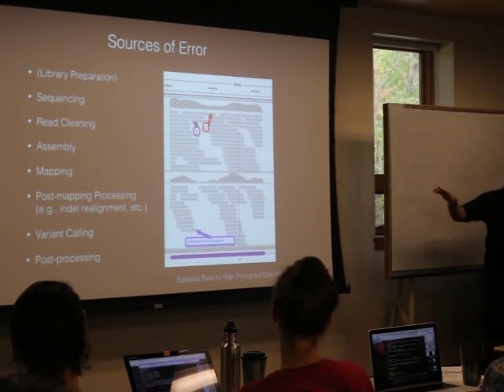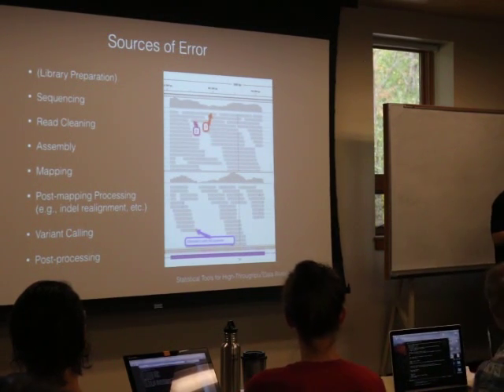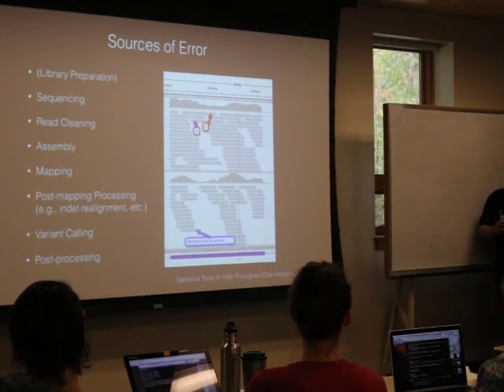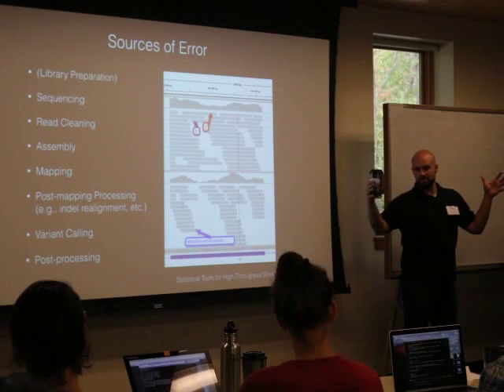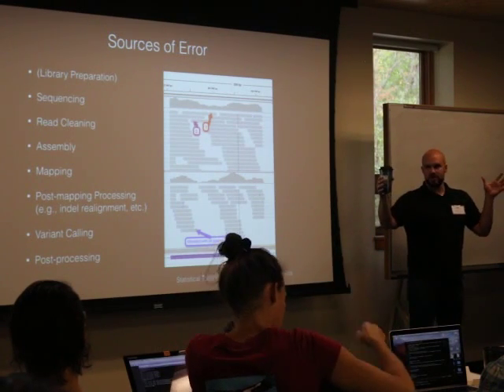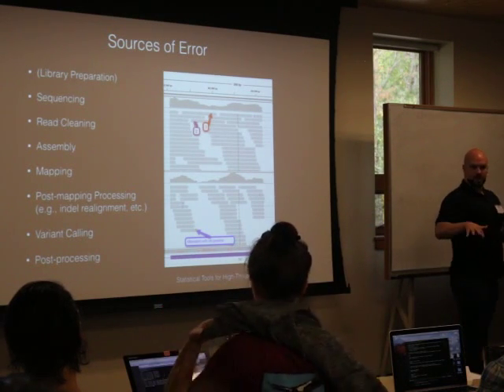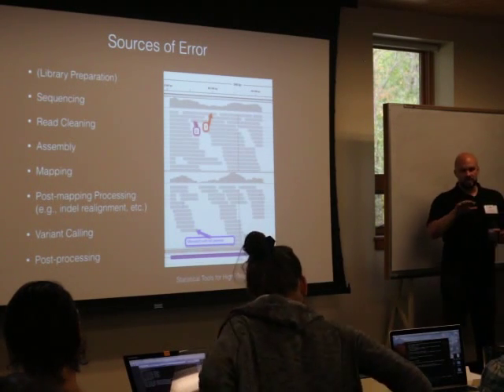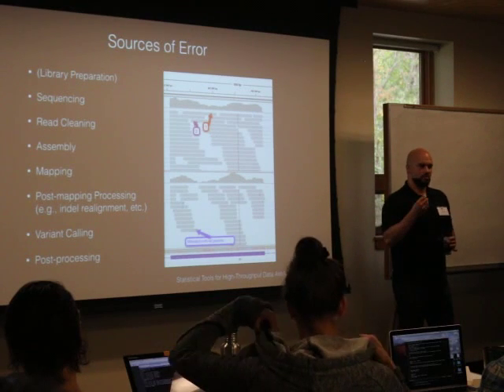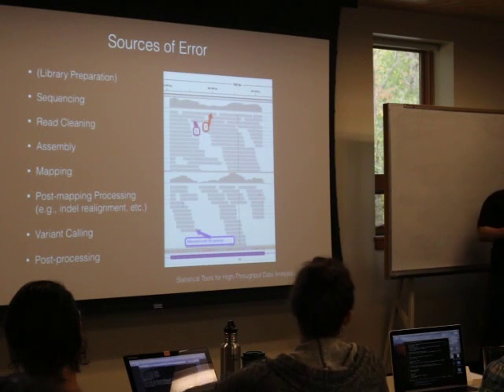The reason I bring this up is that when we think about RAD sequencing and how bioinformaticians analyze things nowadays, the most sophisticated genomic analyses are afforded by systems with established reference genomes. I kind of look at it top down. The stuff I do is across a wide range of model systems, and there are a lot of analyses we might be interested in doing. Then you have these reduced representation approaches, including things like RADs, where we can end up with SNPs to answer questions of interest. But that's going to be a little less powerful than, say, investigating really fine-scale patterns of genetic diversity across the genome in a model system like mice or humans, for example.